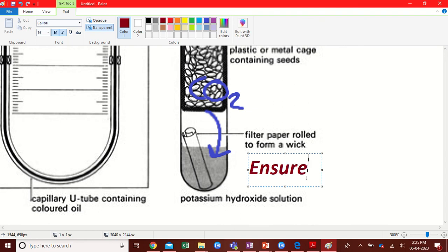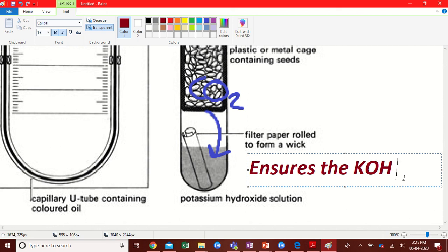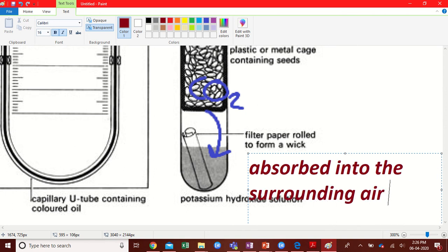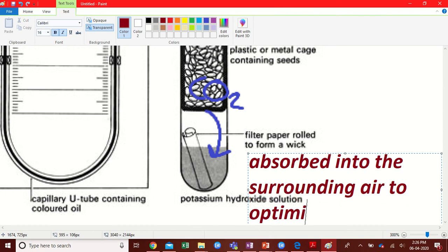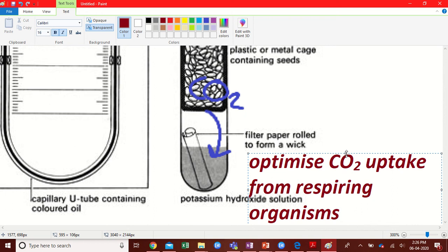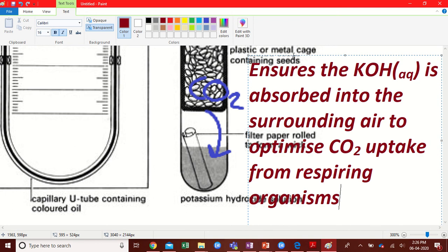So, it ensures the potassium hydroxide solution. K is potassium, OH is hydroxide, solution. So that's aqueous, is absorbed into the surrounding air, to optimize CO2 uptake from respiring organisms. In this case, the respiring organism is the seeds.